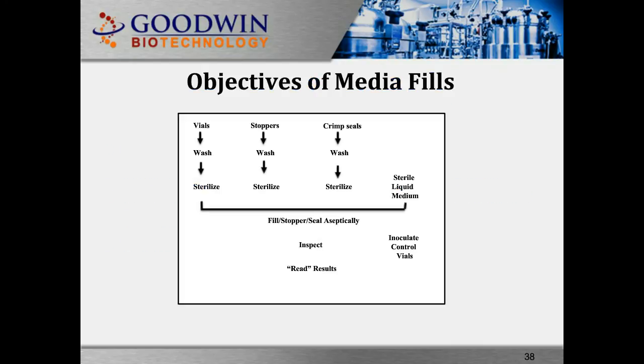For media fill qualification or any fill, the components have to be washed using WFI and/or sanitized and then sterilized using the autoclave or depyrogenated, in the case of glass vials, and filled in a class 100 room, then stoppered and sealed, using the sterile liquid medium.